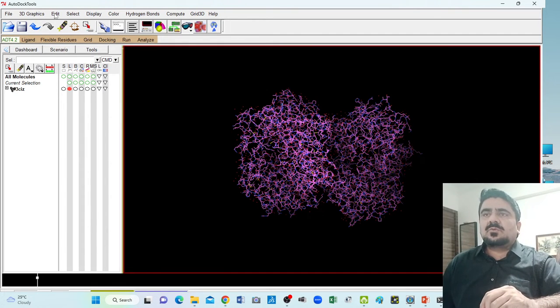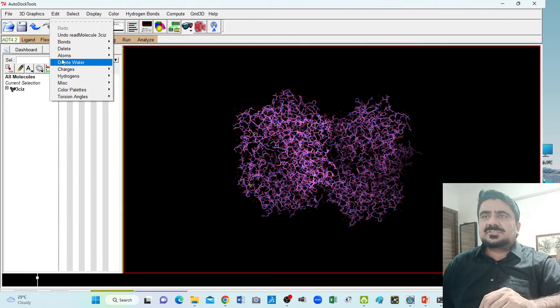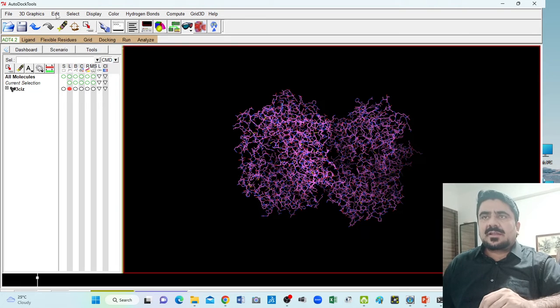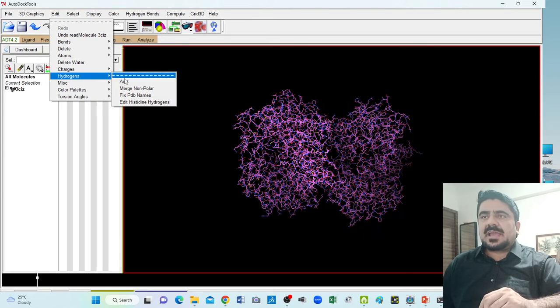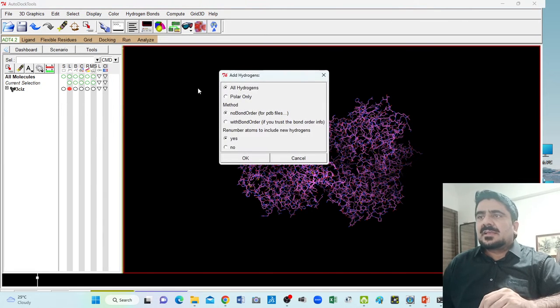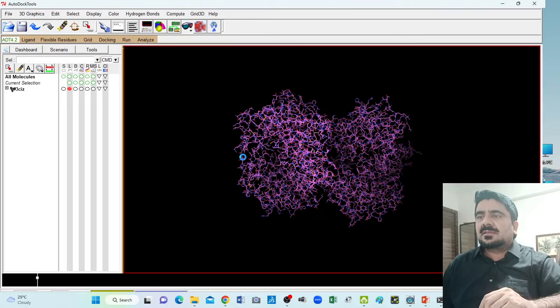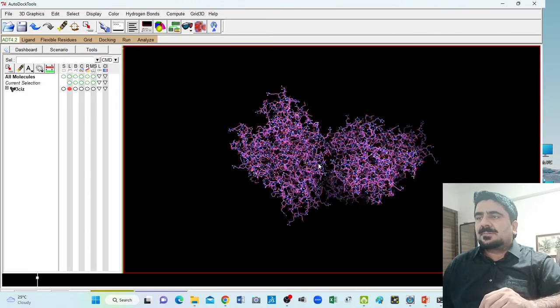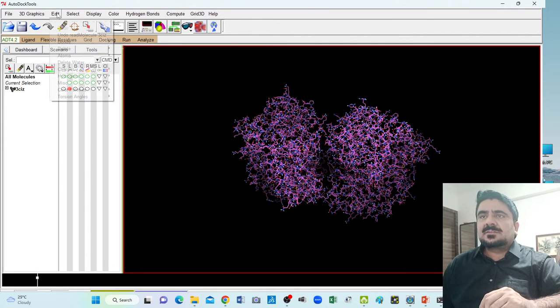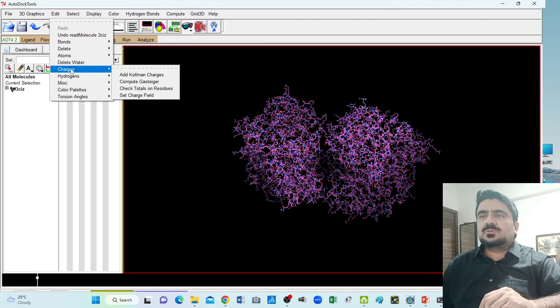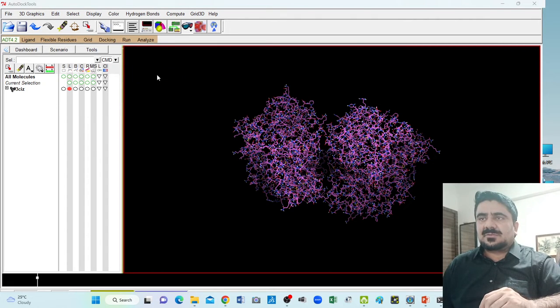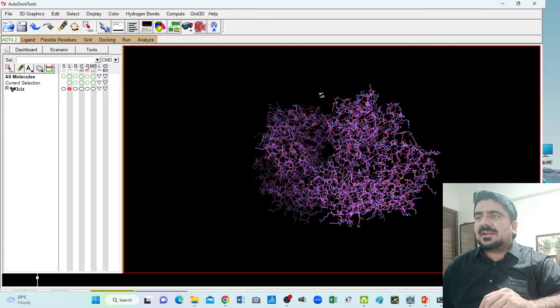Here you can see how to change this PDB file into PDBQT in three or four steps. First step: go to Edit, click Delete Water. Again go to Edit, move to Hydrogen, and click Add Hydrogen. Here it shows options — by default 'All Hydrogens' is checked, but don't use that. Check the second one — Polar Only — which is important for protein docking when converting PDB to PDBQT. Click OK. The polar hydrogens have now been added to the PDB file. Next go to Edit, move to Charge, and click Add Kollman Charges. Kollman charges have now been added.